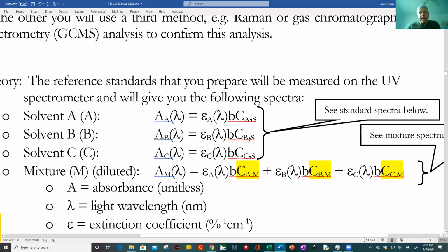So basically, what we did with the acetone was we chose a wavelength where epsilon B was 0 and epsilon C was 0. Does that make sense? Oh yeah, we did for that part where they were at 285, where only acetone was present, with the kinetics thing.